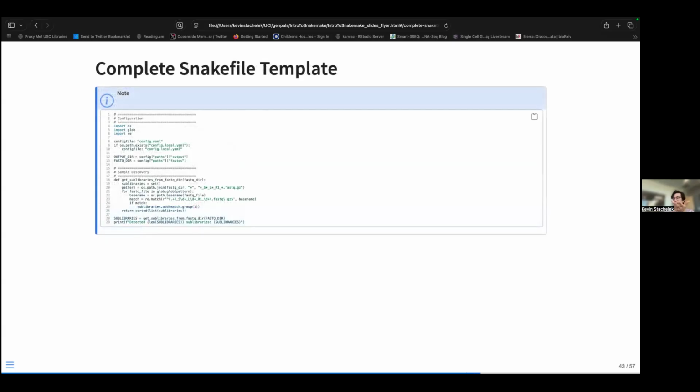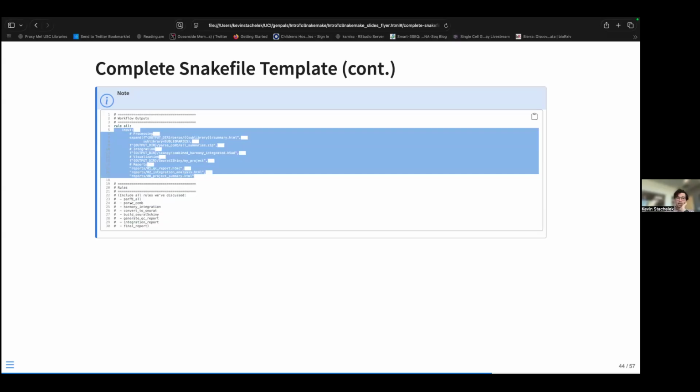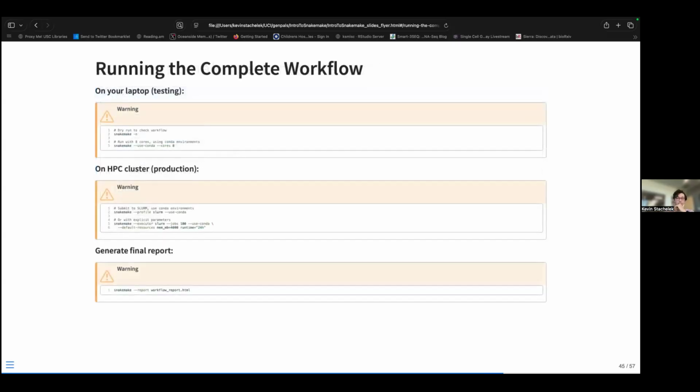And all of that output would be generated through this Snakefile that I have here. So with arbitrary Python code and then individual rules, foremost that rule all that specifies the final outputs that I want to get, and then individual rules that I'm not going through here that describe each of the inputs and outputs of each step.